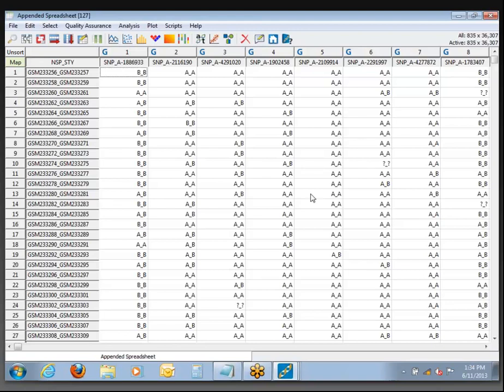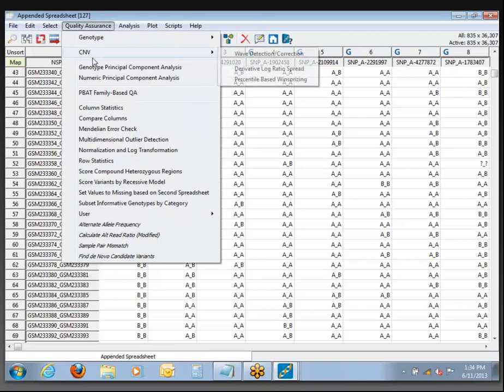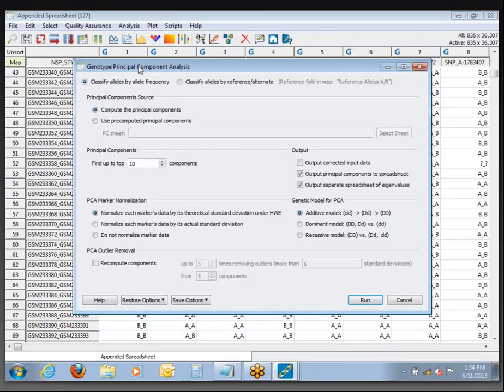We won't get into that much today, but there are utilities for changing strand orientation and helping to match data up. What we want to do is go ahead and run principal components analysis. In the Quality Assurance menu, under Genotype, Principal Component Analysis — I think we're just going to go ahead and run this. The tutorial says to turn it down and only get the top five components, which will save us a little time. So we'll do that instead of the default 10.